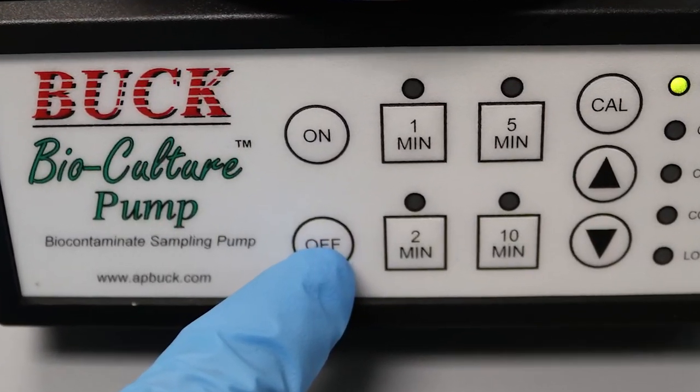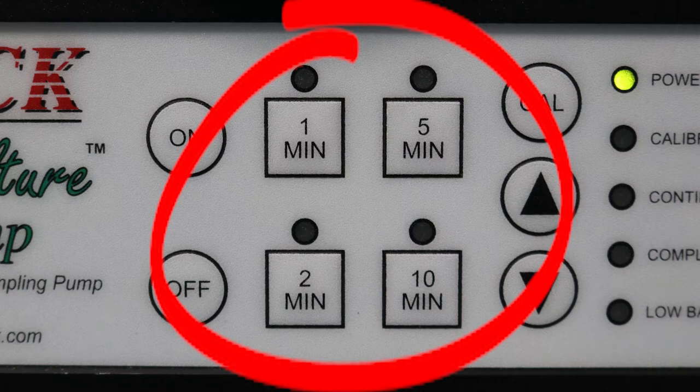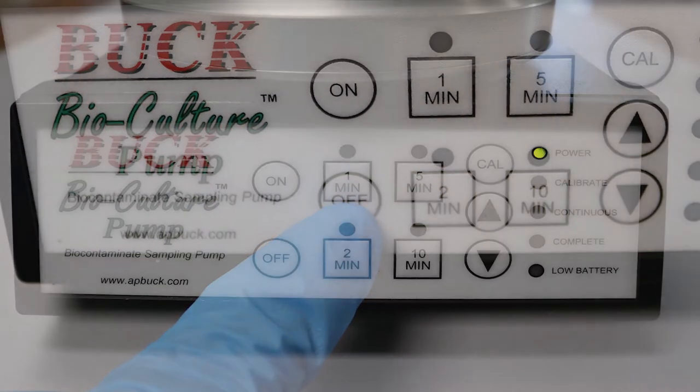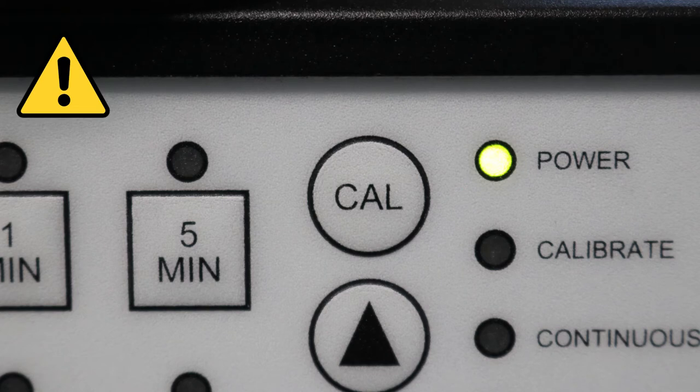Then turn the pump off. Verify the flow rate with the calibration head by selecting a 1, 2, 5, or 10 minute timing route. Press the off key to stop. If the verification flow was accurate, entering CAL is not necessary. Please note, entering the CAL mode removes the previous setting to allow for a new flow rate.